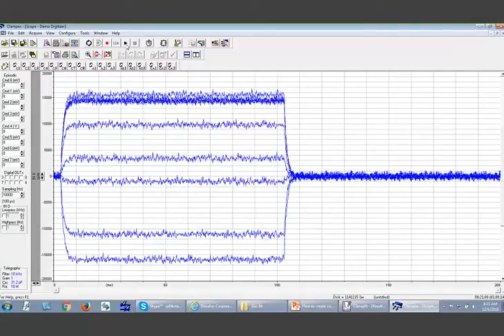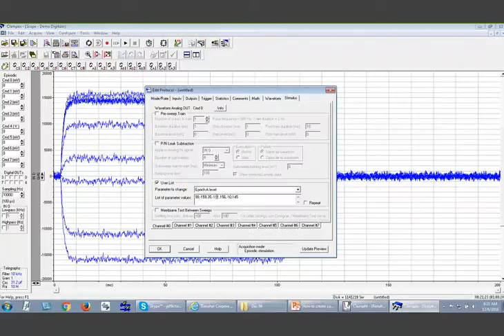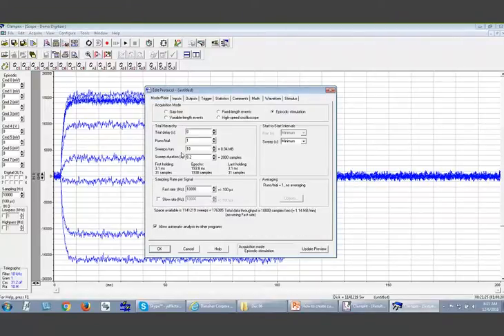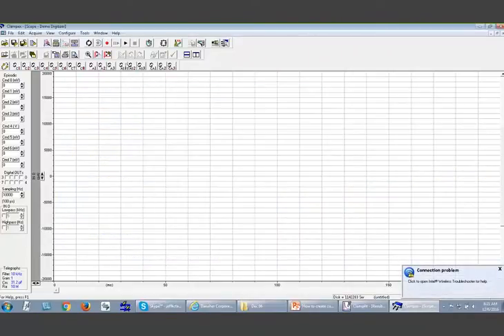Now you can see the sweeps have the holding levels that you created under the user list. As I mentioned, since I only have 7 values here, but I have 10 sweeps, the last 3 sweeps basically follow the 145, right? So let me show you one more time.